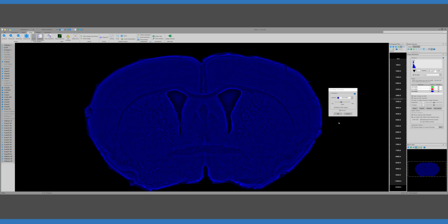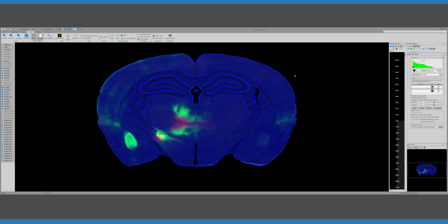It wouldn't be something that would be used for correcting the illumination of things like the anterograde tracers and all that. Anyway, with that, I think we'll go back to the original.